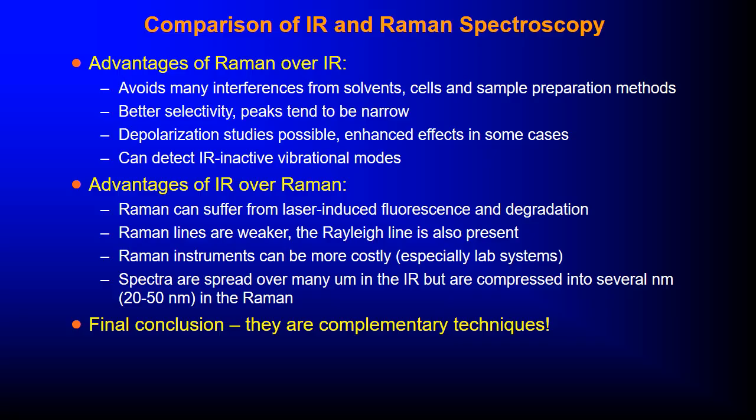Depolarization studies are possible, with enhanced effects in some cases. You can detect IR inactive vibrational modes, for example, we've just talked about the vibrational modes in dinitrogen.